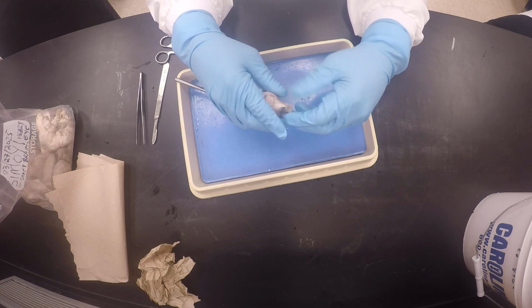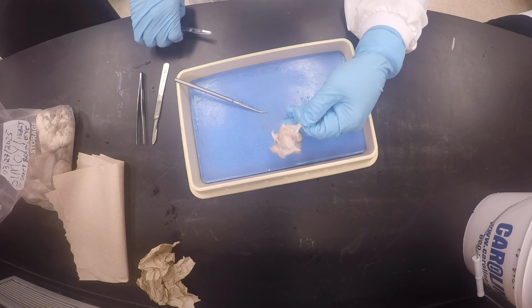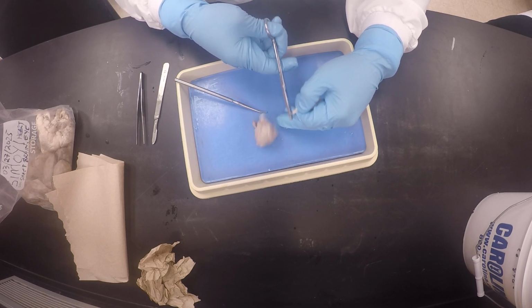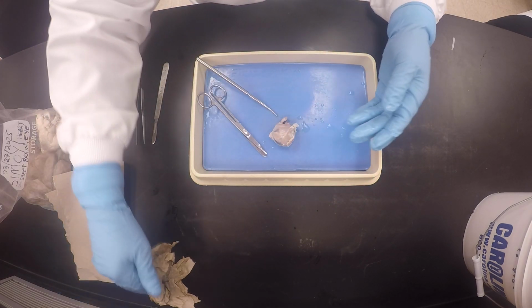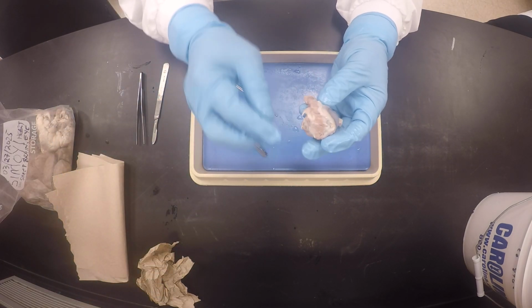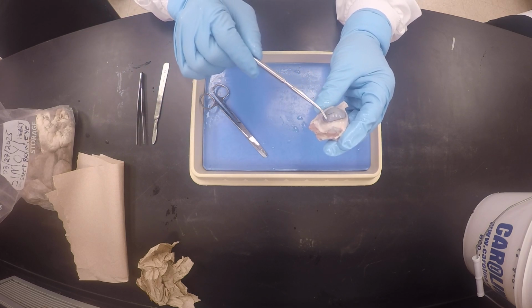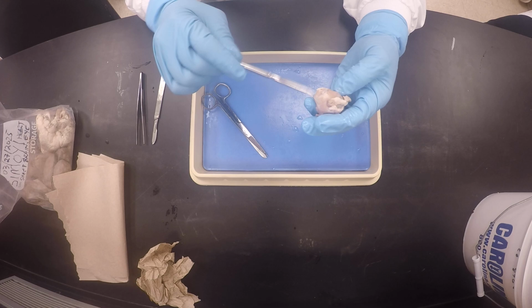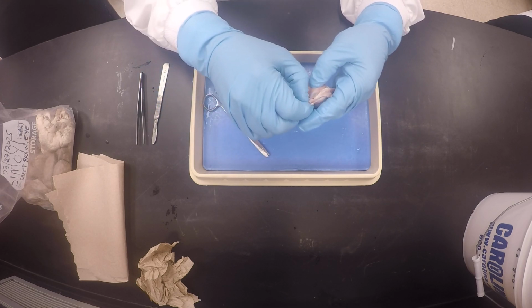Okay, very good. Just to clean it up a little bit, so you can see more of the retractor bulbi, like that. And then we get to cut. Do you see how we don't make any incision before we have identified all our extrinsic eye muscles and the external stuff? Obviously, this is the cornea. Okay, very good. And obviously, this is the sclera on the back. Okay, so this is what I was talking about.